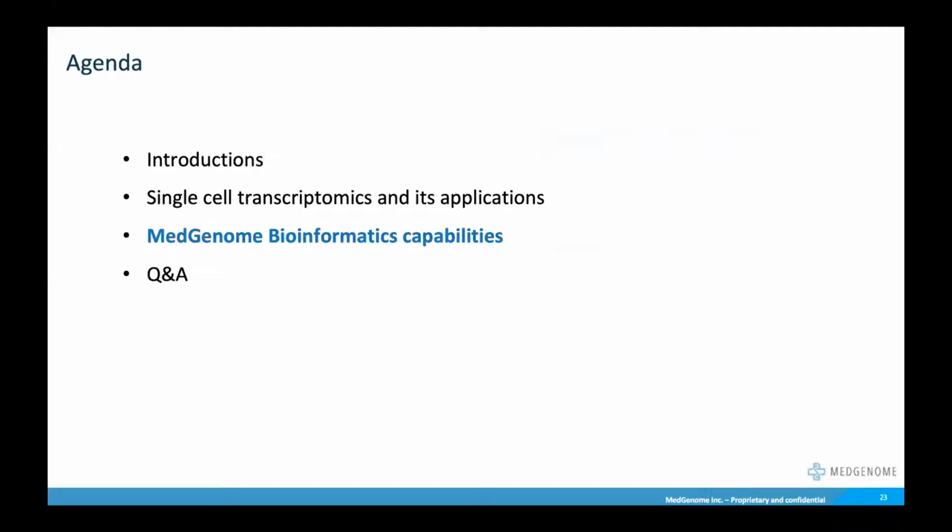Thanks for that very nice introduction to single-cell transcriptomics and the myriad of applications that have really exploded in the last few years. So what I'm going to do is walk you all through some of the bioinformatics that's involved in single-cell genomics data analysis and, more specifically, immune repertoire analysis.